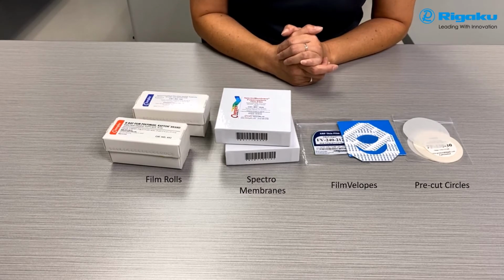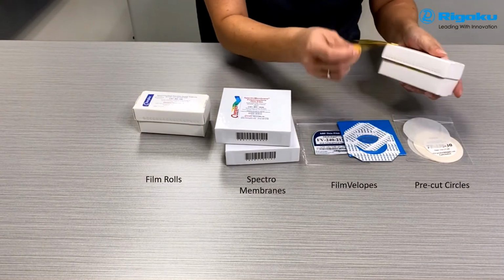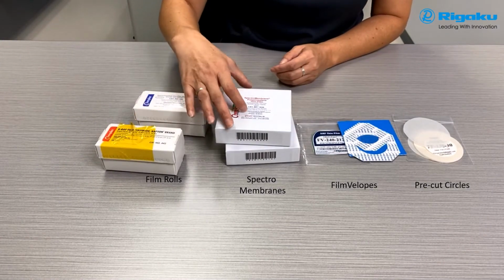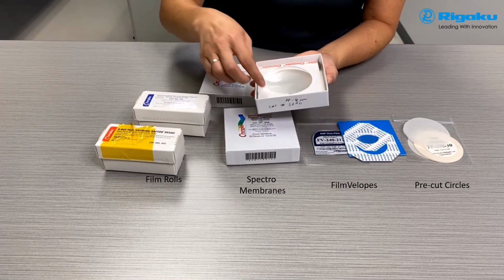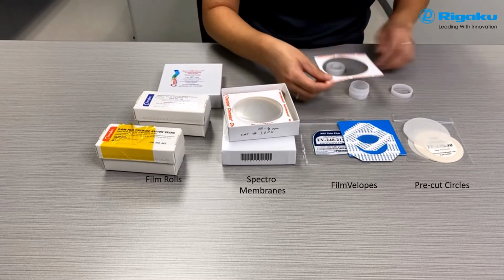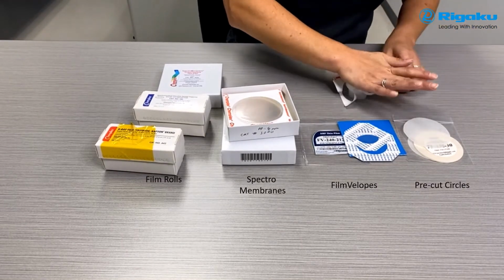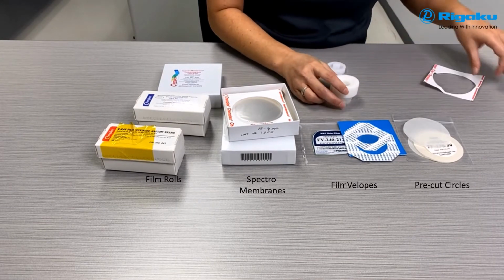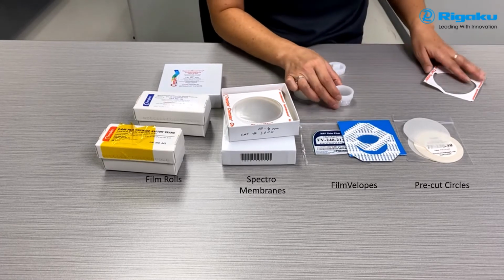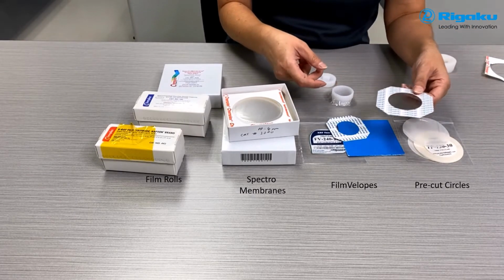Right. The poor man's version's good, but it can be staticky, right? Right. But it's a lot cheaper, obviously. The spectrum membrane or the film envelopes are real convenient because it's easy just to set up on top of a sample. Ton takes a sample there and sets it up as she presses it. It's so easy. It's not going to stick to her fingers. Although one time I witnessed Ton putting two films on. Actually, we didn't witness it. We found it out through the data. But that's another story.